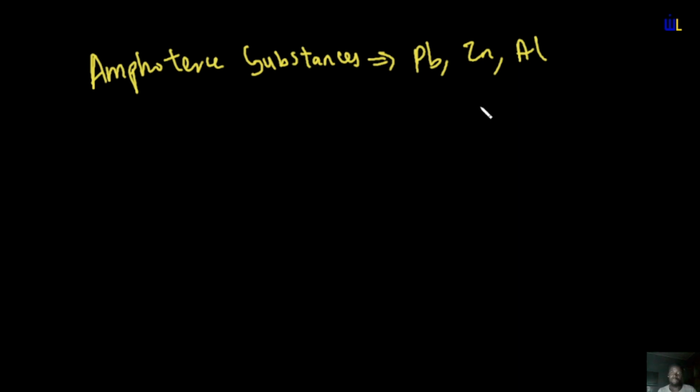So have this in mind, that any hydroxide of lead, zinc, or aluminium will dissolve. Why will it dissolve? Because it is amphoteric, and that is, it dissolves in excess. So you are seeing that with this now you have cleared some things. Whenever you see a particular reaction and you hear where the precipitate dissolves, you're either suspecting Pb, Zn, or aluminium. Every other precipitate does not dissolve in excess sodium hydroxide. Okay, let's get to work.